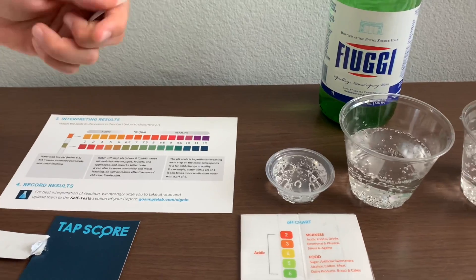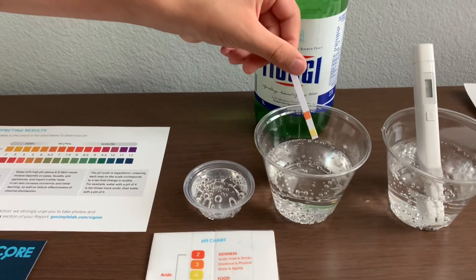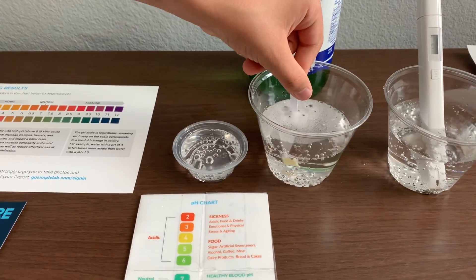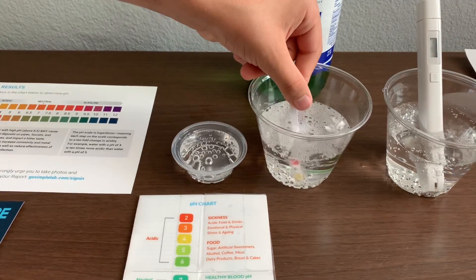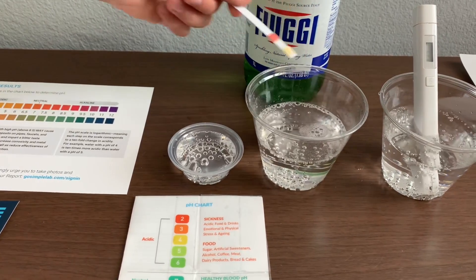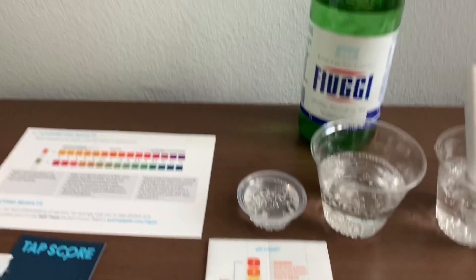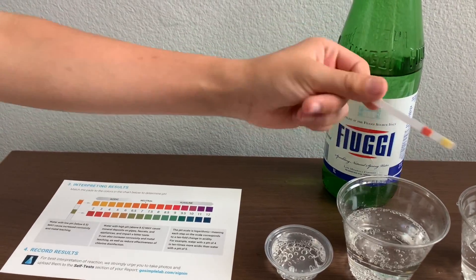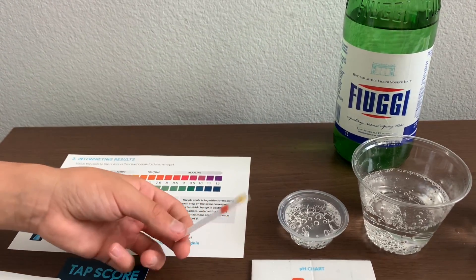We're going to take out the strips and put them inside a filled cup of water. We have to move them in a back and forth motion for 10 seconds. Then we remove it from the water and quickly shake it once to remove the excess water. Then we have to wait 20 seconds before we check the results.